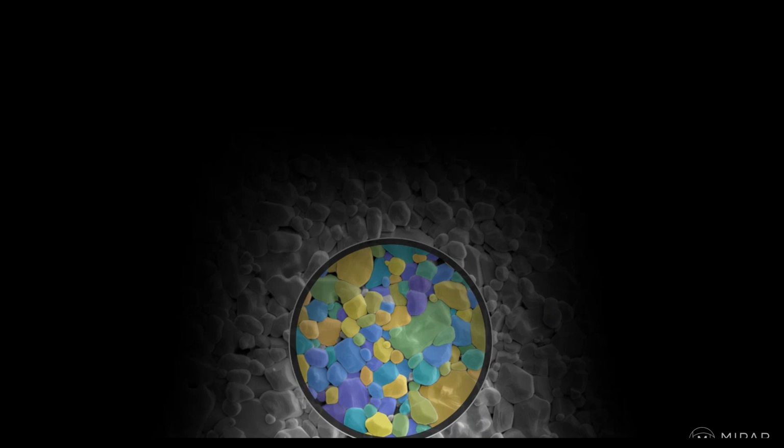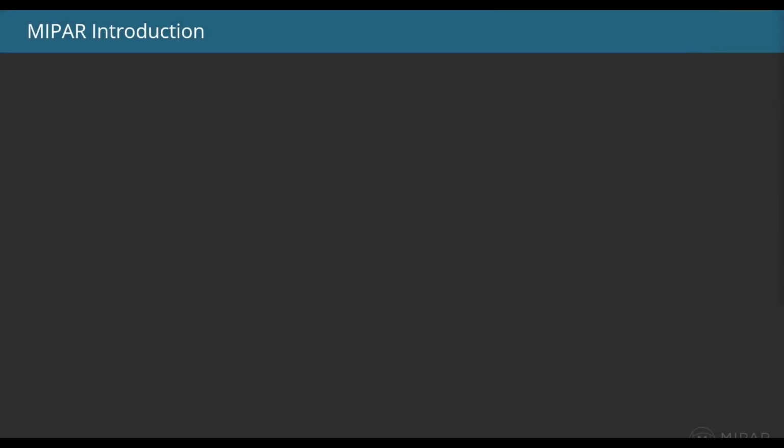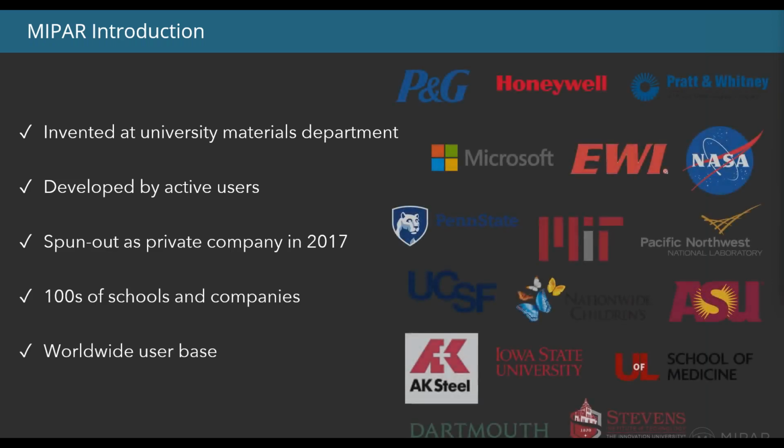I'll start here with a brief intro to the MIPAR organization for those that are unfamiliar. It began as a project at a materials department in a university, and continues to be developed by those that use it almost every day.